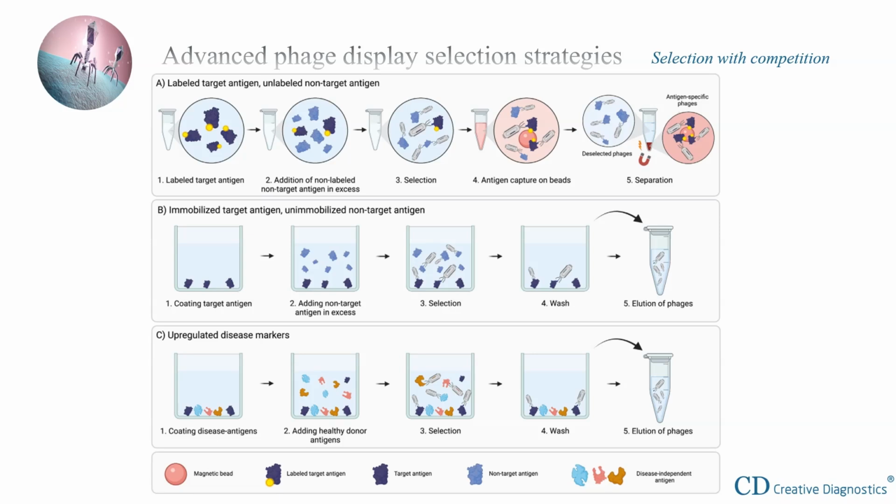Often we want to avoid antibodies binding to antigens that are similar to the target antigen. In other words, we want to focus the selection on parts of the target antigen that are unique, and reduce antibodies that bind to shared regions with related antigens. To do this, a deselection step is usually done first, where antibodies that bind to related antigens are removed. However, this step isn't 100% effective, and its success depends on the antigen concentration and the antibody's affinity for the shared region.